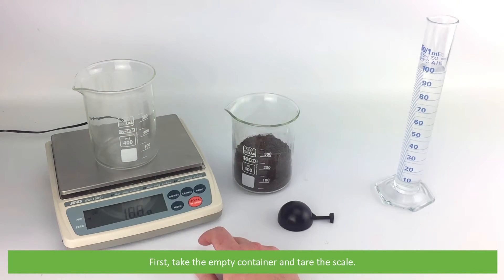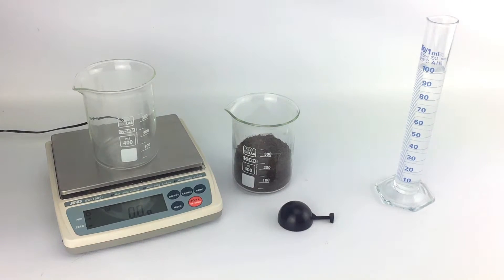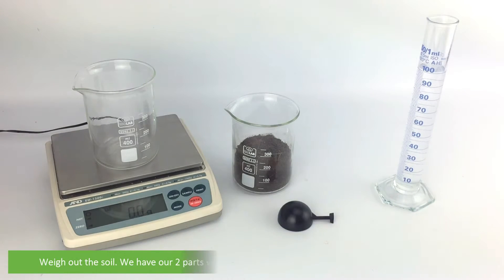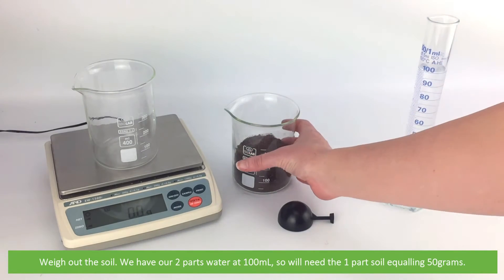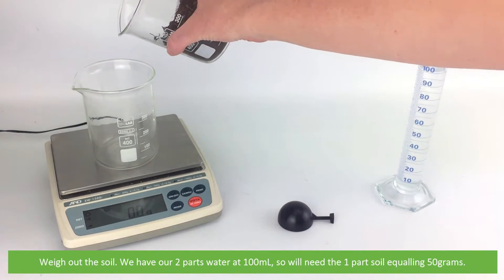First, take the empty container and tare the scale. Then weigh out the soil. We have our two parts water at 100 mils, so we will need one part soil equaling 50 grams.